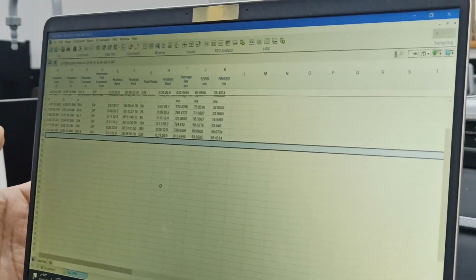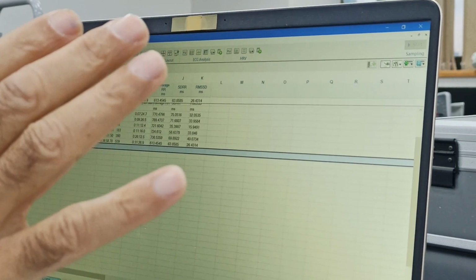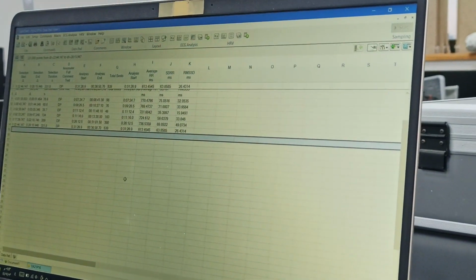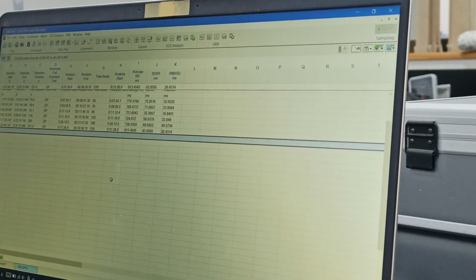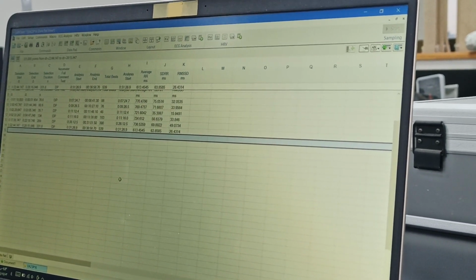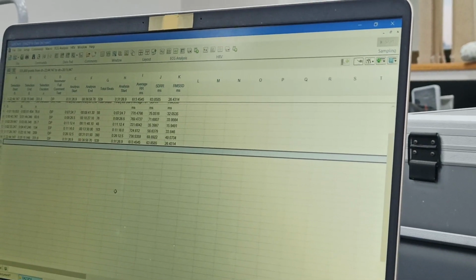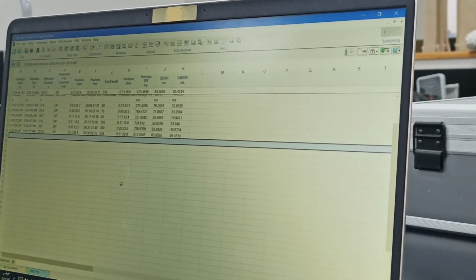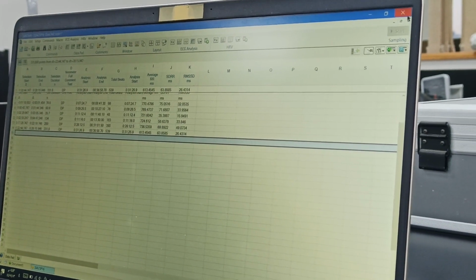What's the difference? In the settings file, all the settings whatever we have done will be there, but the data will not be there. Now you open this settings file, it is just a template. Then append the data file to this one. So now you don't have to do the settings every time. All the things are already there. You just add data, and the data is there. Clear? Now see, if I now open the file, I first close this one.